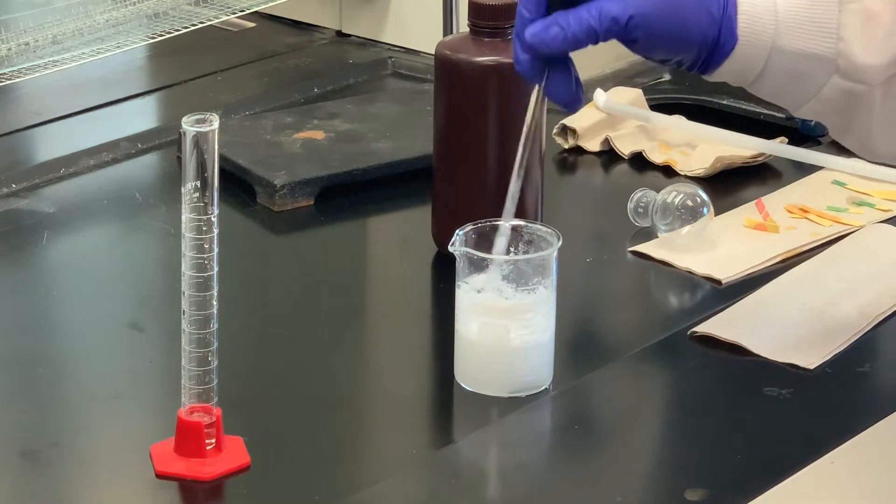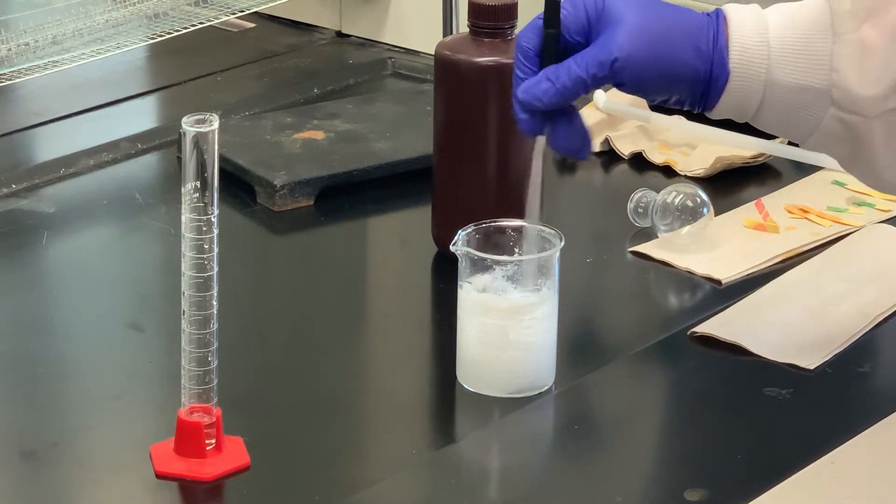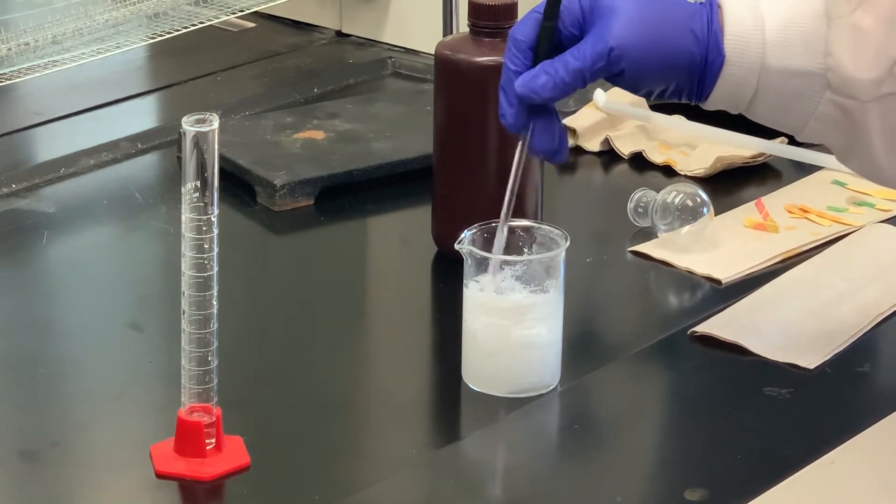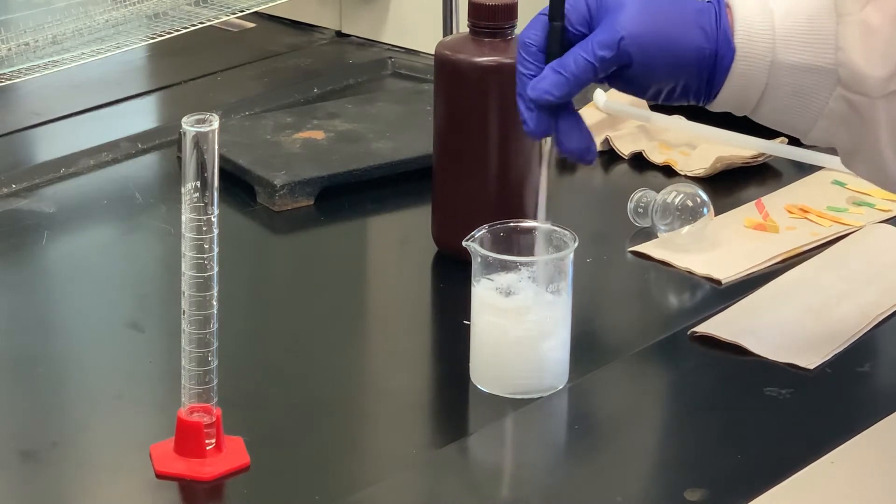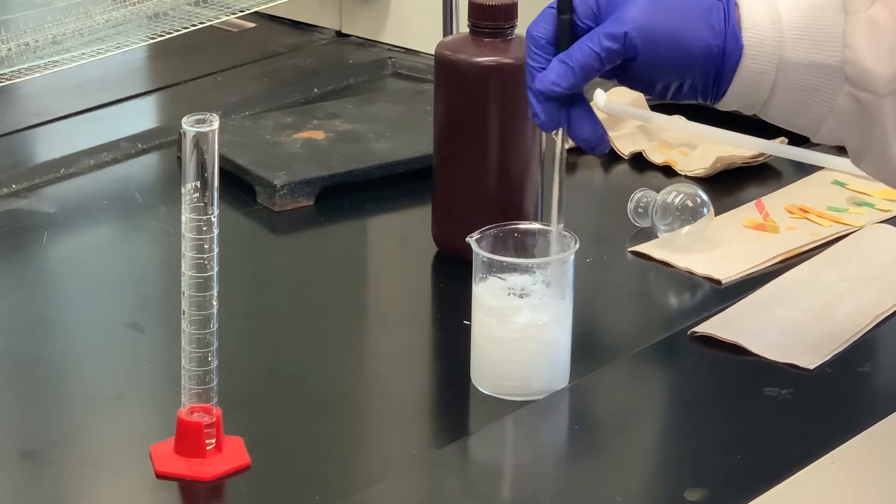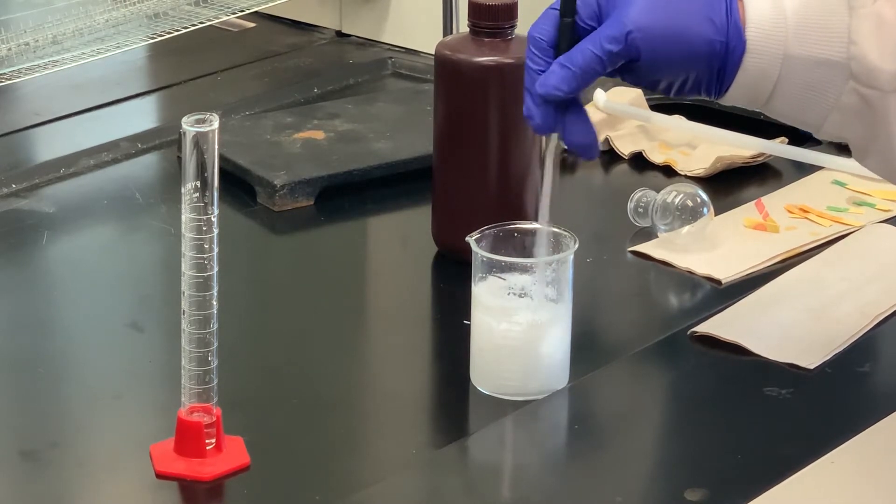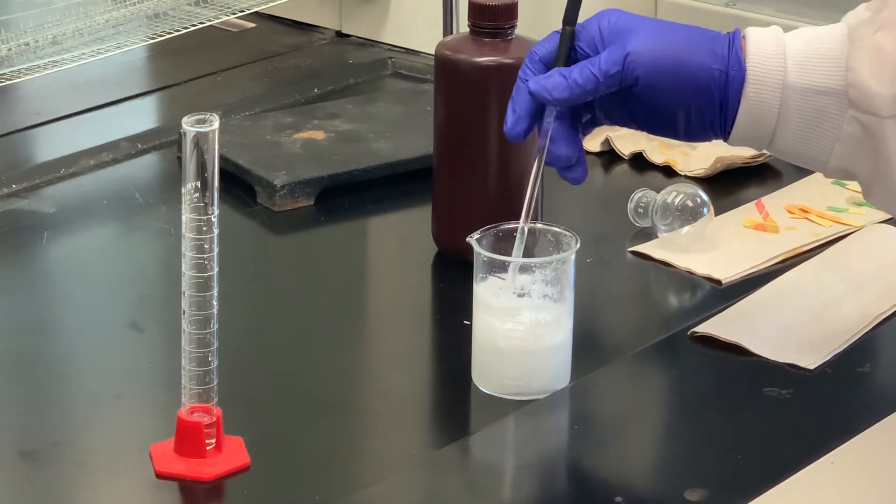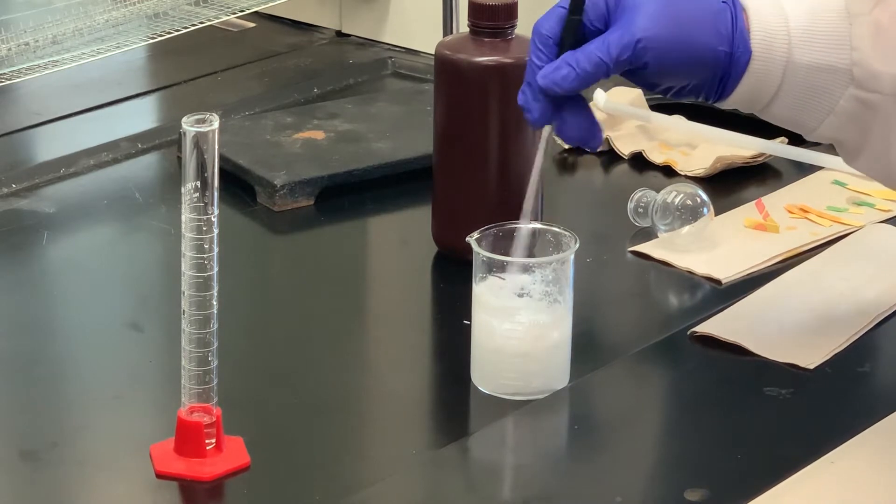And then what we want to do, we're going to filter this by vacuum filtration. And then wash it, after it's being filtered, we'll wash it with some cold water. And then we will take the solid that we collect, squeeze it through some filter paper, get a weight and a melting point.